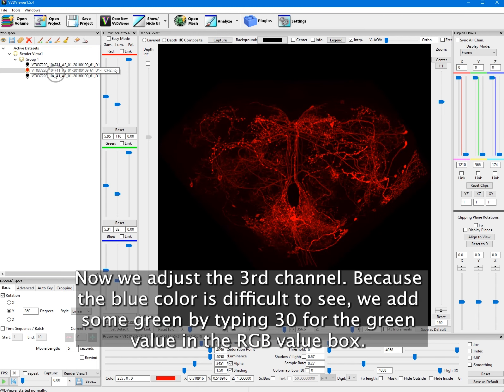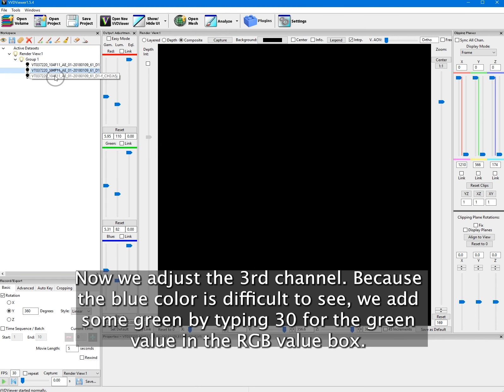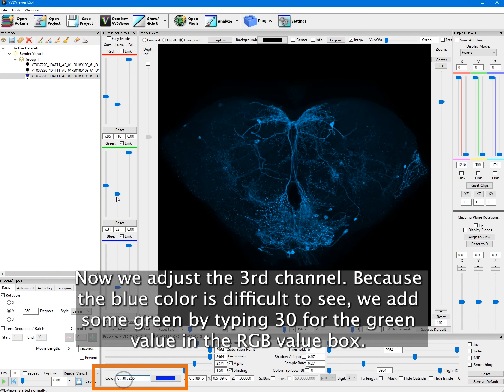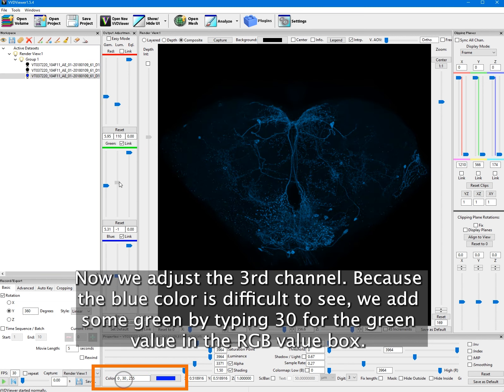Now we adjust the third channel. Because the blue color is difficult to see, we add some green by typing 30 for the green value in the RGB value box.